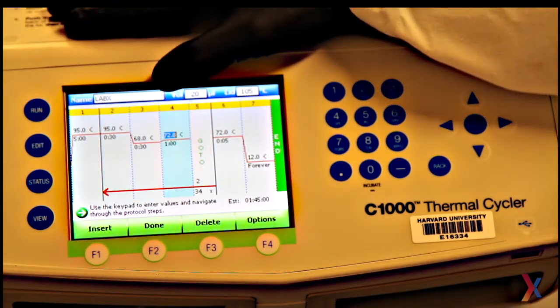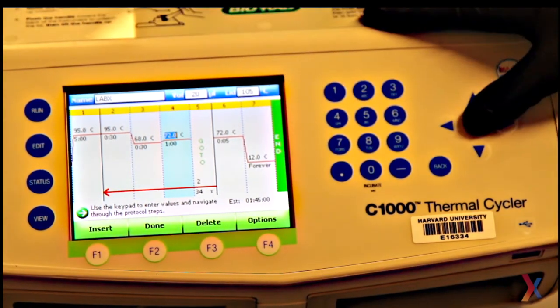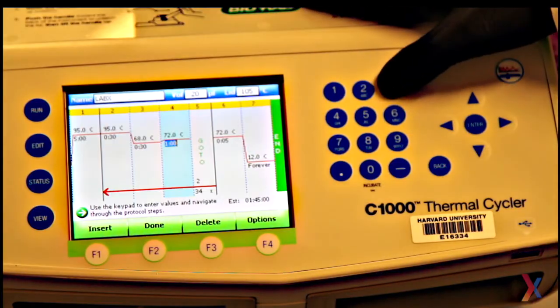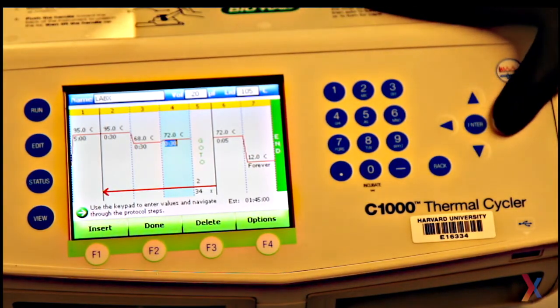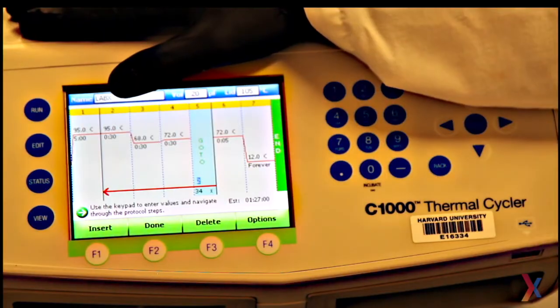And then the last step of the cycle is extension. I want this at 72 Celsius for 30 seconds. Then this cycle will repeat 34 times.